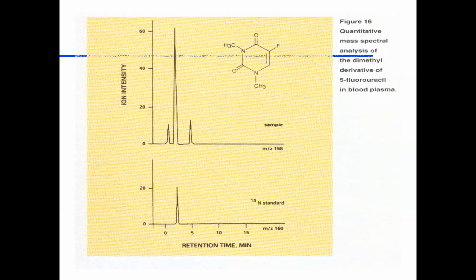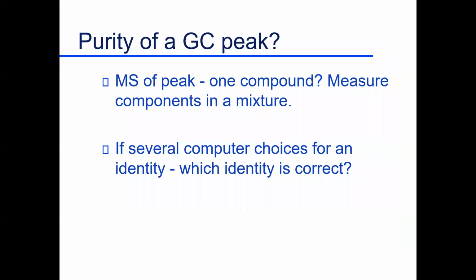So, like I say, you always look for an internal standard. If you want to quantify anything, you have to have some benchmark. It has something to anchor it against. And so often we choose another compound, not the same compound we want to measure, like benzaldehyde. We could use almost any other compound. And okay, that works as long as we get separation. If you can use exactly the same compound, then it's really good quantitative data. So basically, using mass spectrometry to be that selective is a tremendous help in terms of accuracy and quantitation.